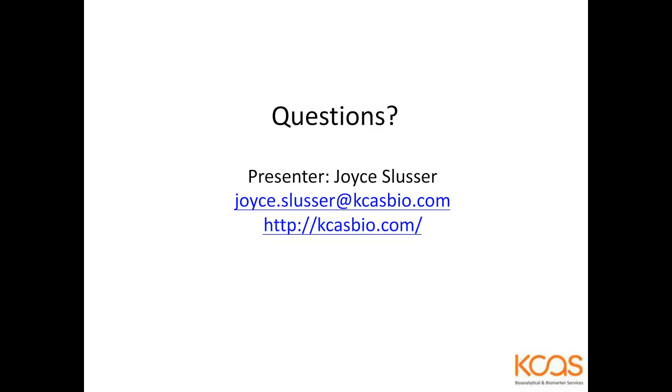Hello. So it looks like Beckman Coulter is going to reply to the auto gating question. Yes. This is Laura Pajak. I am the product manager for Kaluza, and a couple comments. Kaluza at this point does not have auto gating. It is on our roadmap for future builds.